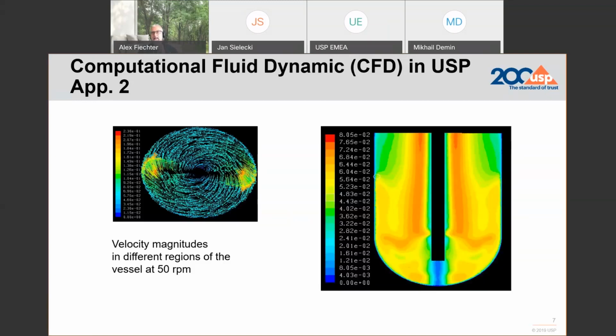If the peak is not formed the way you are used to, this powder peak, if it's left-shaped, right-shaped, or it is flat, these are all indications that something is going on within the tester itself.